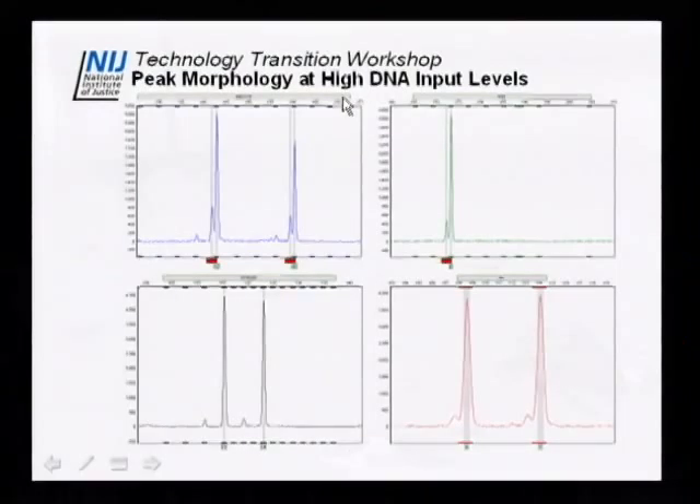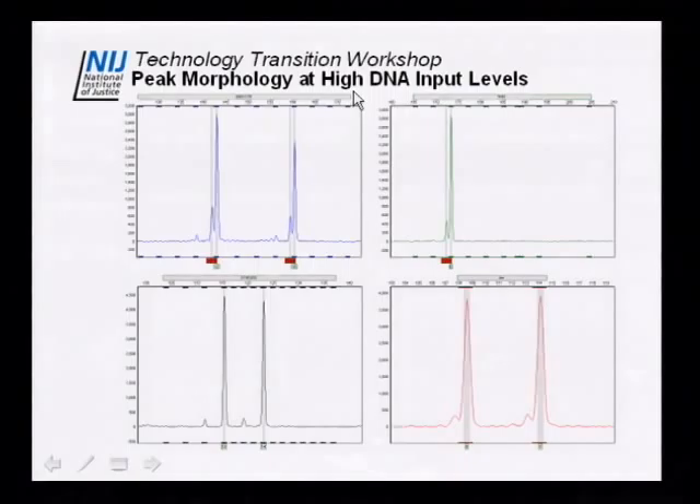While the high DNA input template range is good, increasing template into PCR can produce artifacts like incomplete nucleotide addition. This plot shows that at 6 nanograms we don't get saturation of the peak — the morphology of the adenylated peaks is still good with no flat-topping. Additionally, the template strand is easily resolvable, and since these are single base pairs apart, you can still see them very clearly.